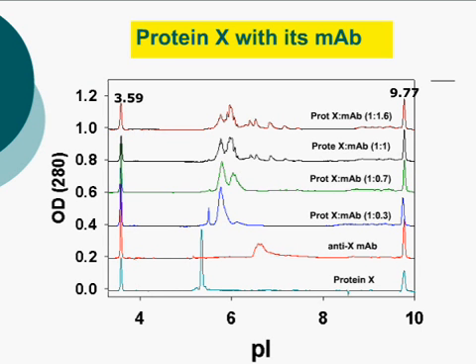And again, you'll notice that the acidic peaks of this protein have also shifted together with its main peak, again indicating that these acidic forms are active in terms of binding to the monoclonal antibody. And if you remember earlier when I discussed the 3-month stability study, we did test the 3-month sample by ELISA, and we did not see any change in binding. And this agrees well with what we see here. So again, we were able to show rather quickly that the acidic variants for this protein are also able to bind to its monoclonal antibody.